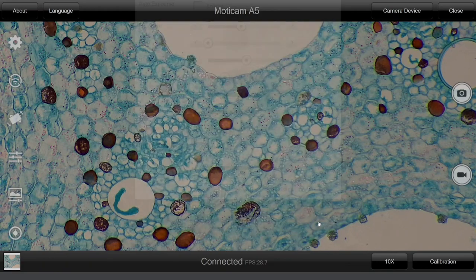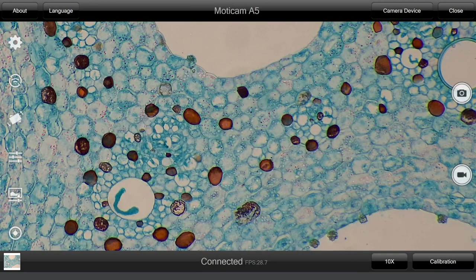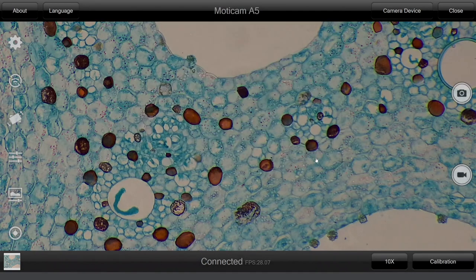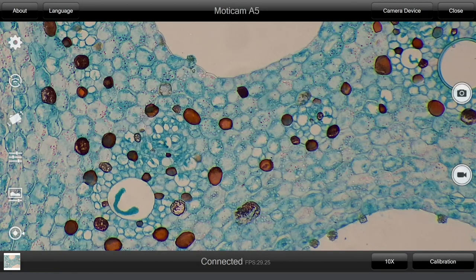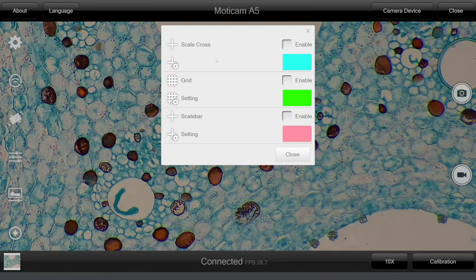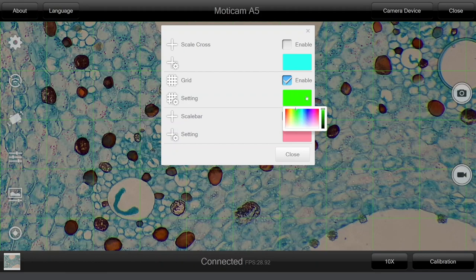Should you need to make any color correction, just select the below icon and change whatever you need. From the last icon you will find on the left, it is possible to add scale cross, grid and scale bar by just simply clicking the enable box. You can even change the color to whichever you prefer.